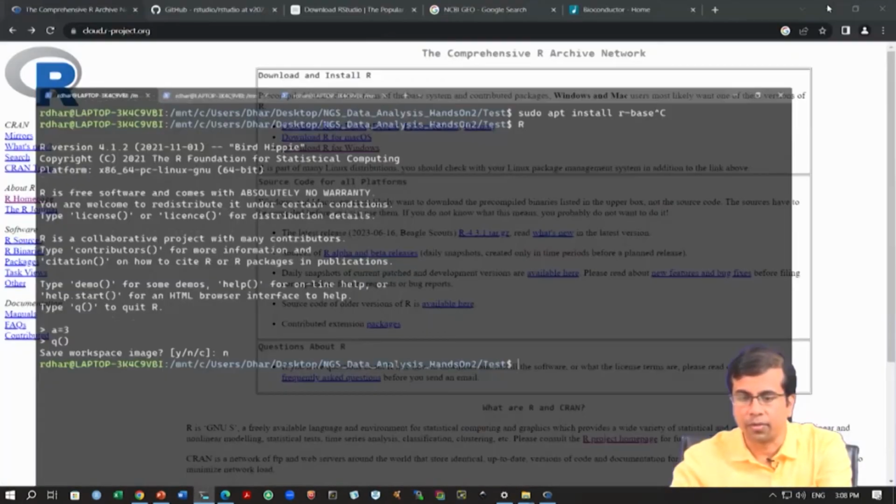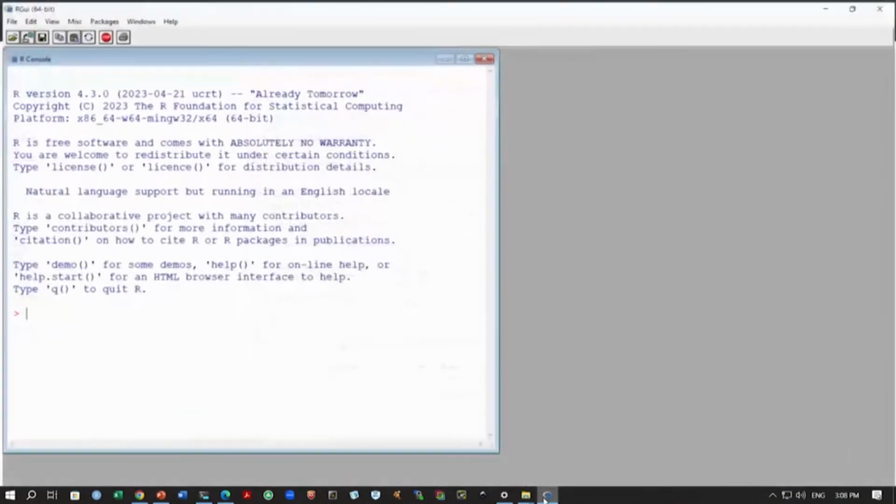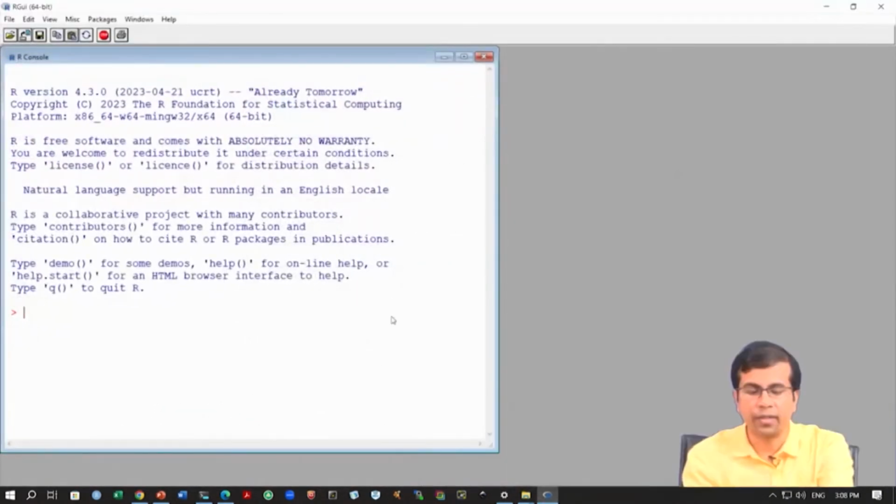All right. So, now going back to R here. R can support a lot of different data types. You can have lists, you can have vectors, you can have matrices. So, different types of data can be used in R.